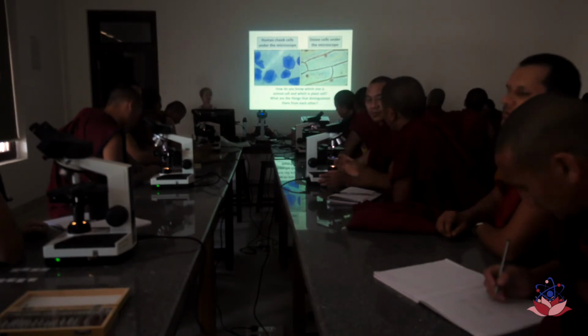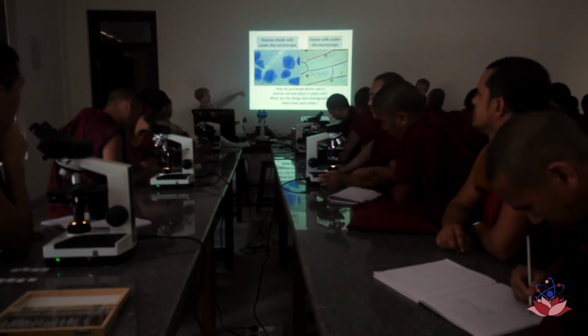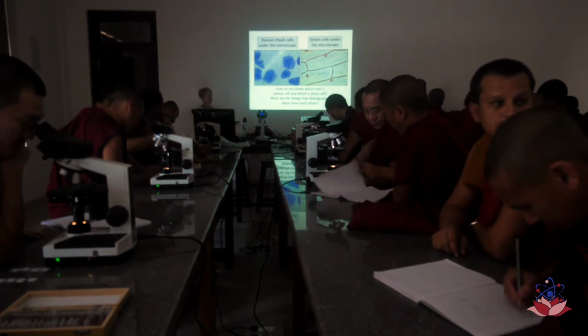So our goal for today is for everyone to create 2 slides. One slide of your cheek cell, one slide of an onion cell.